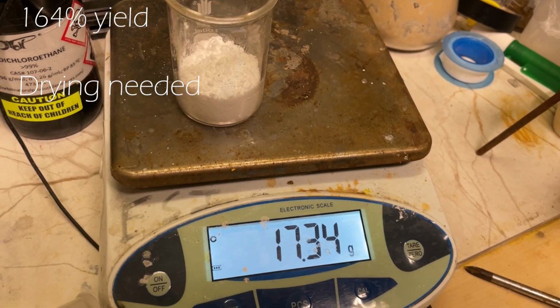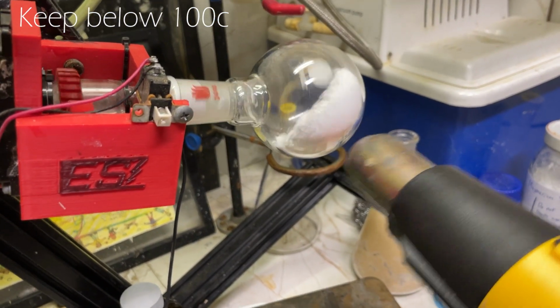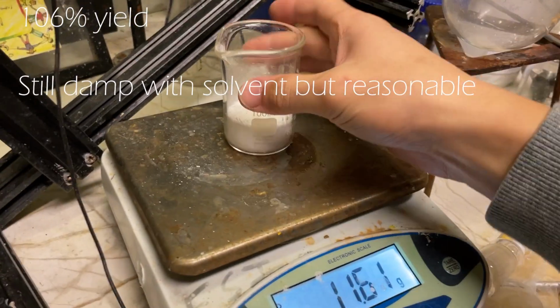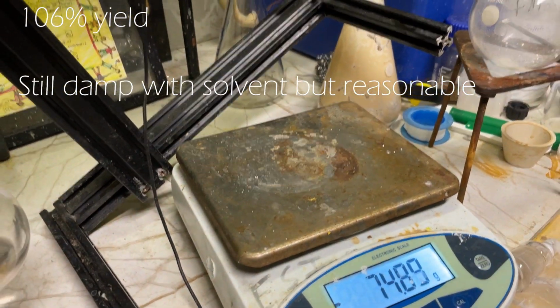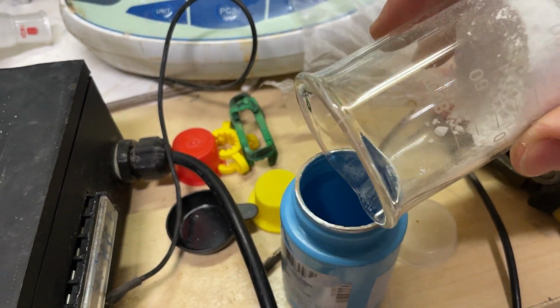So I went ahead and put the powder back in the flask and dried it under vacuum further. You have to keep this below 100 Celsius. Above that, it starts to decompose. And now I have 106% yield, but that's acceptable. It still smells like dichloroethane, a bit of acetic acid, so I know it's fine. And, yeah, I need funnels.